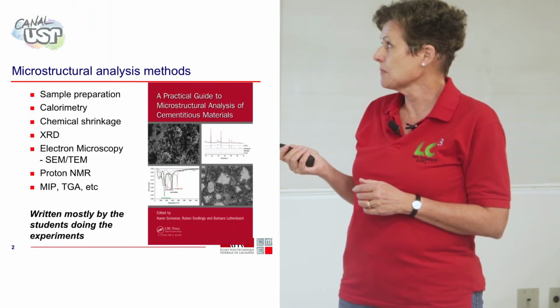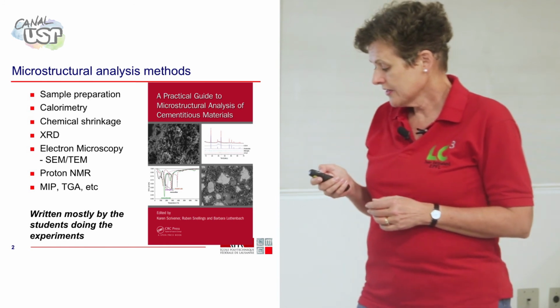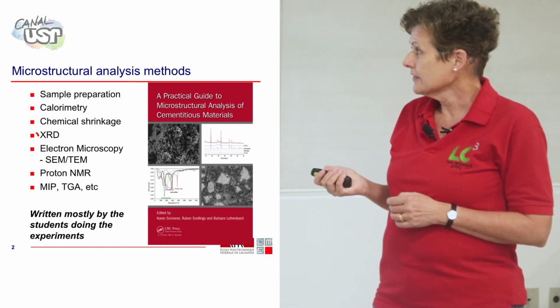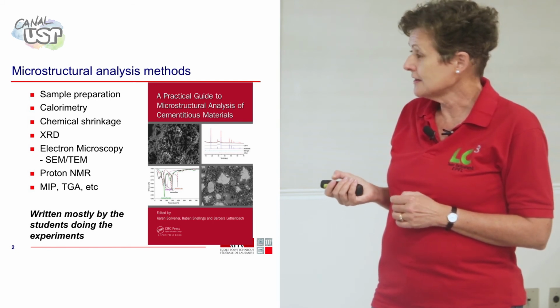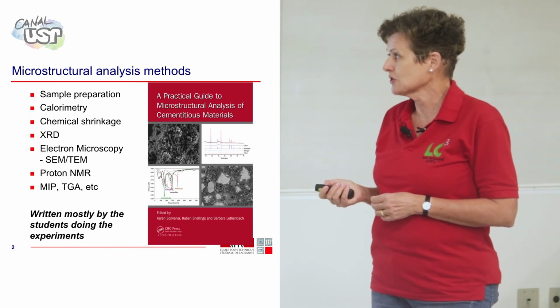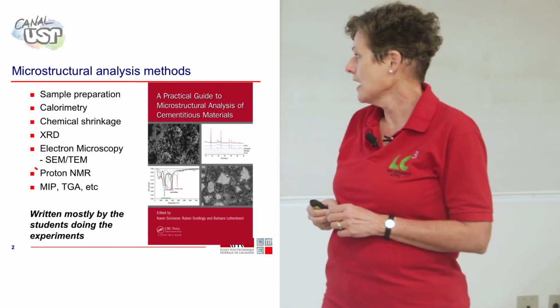And today we're not going to be able to cover everything. So I'm going to give a brief introduction and talk a little bit about sample preparation, calorimetry, and chemical shrinkage. Then I'm going to talk about X-ray diffraction, then electron microscopy. TG Vanderley is going to talk about this afternoon, and then I'm going to finish by talking about techniques for looking at pore structure, proton NMR, and MIP.